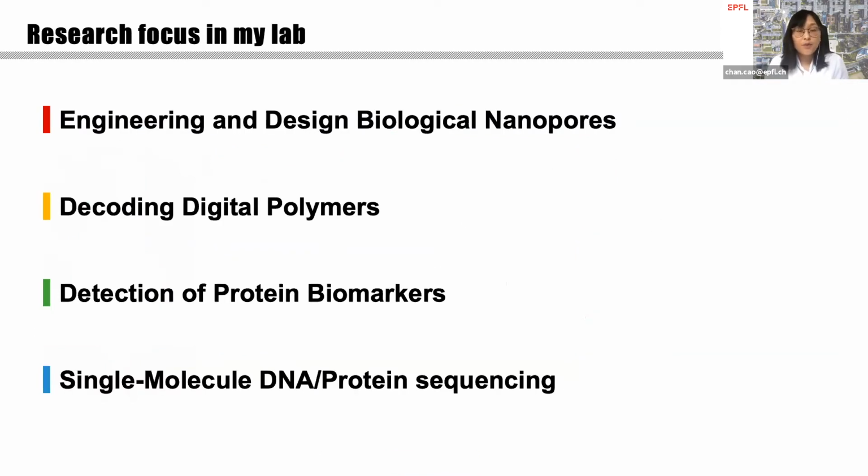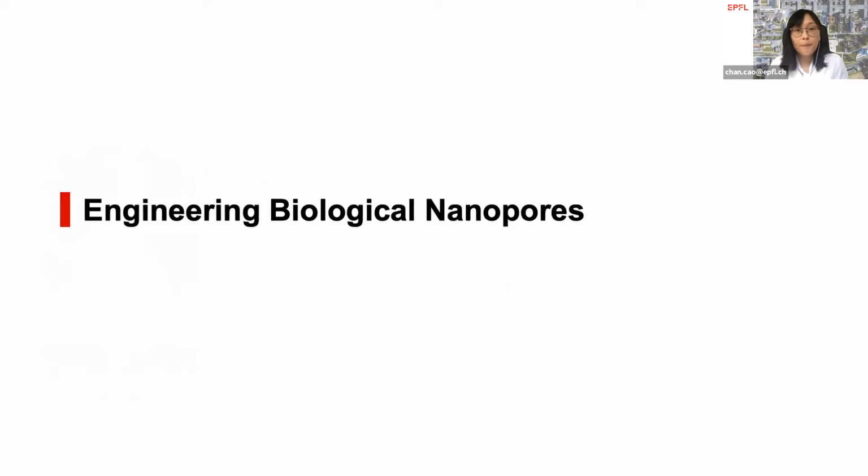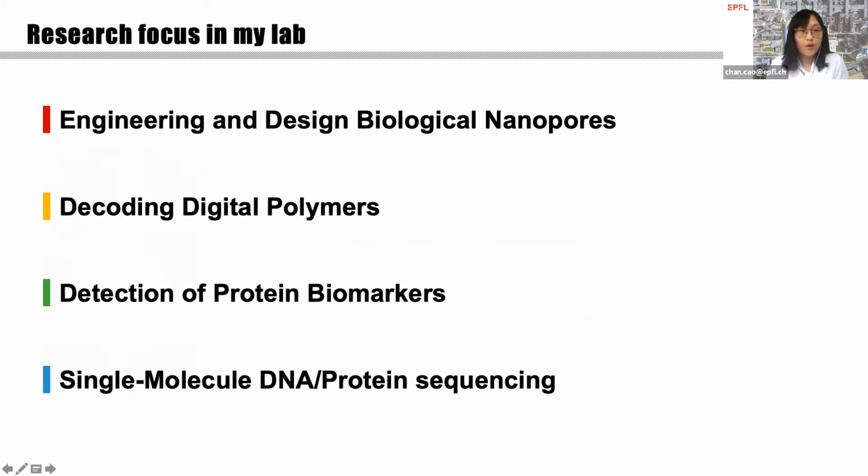In my lab, we focus on engineering and designing new biological nanopores, and we have three main focuses of application, including decoding digital polymers or protein biomarker detection. And as a nanopore group, of course, we're interested in DNA or protein sequencing as a long-term interest. For today, I will talk about only engineered nanopore and the digital polymer, these two parts.